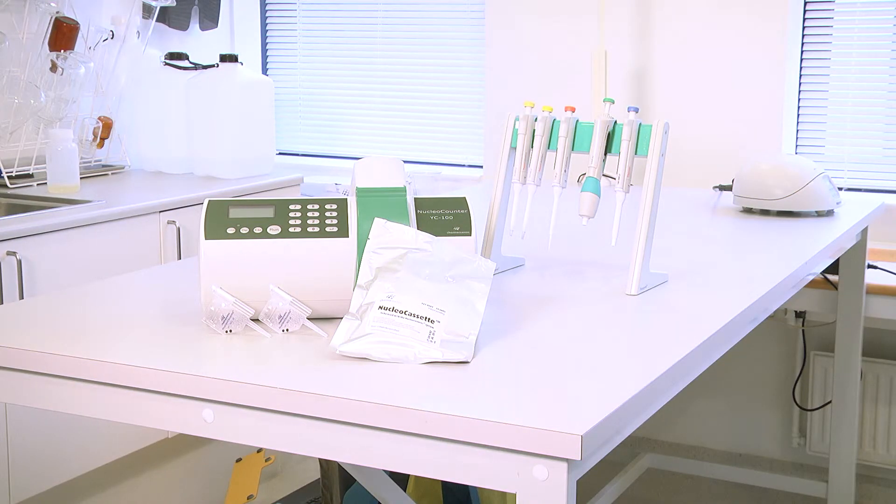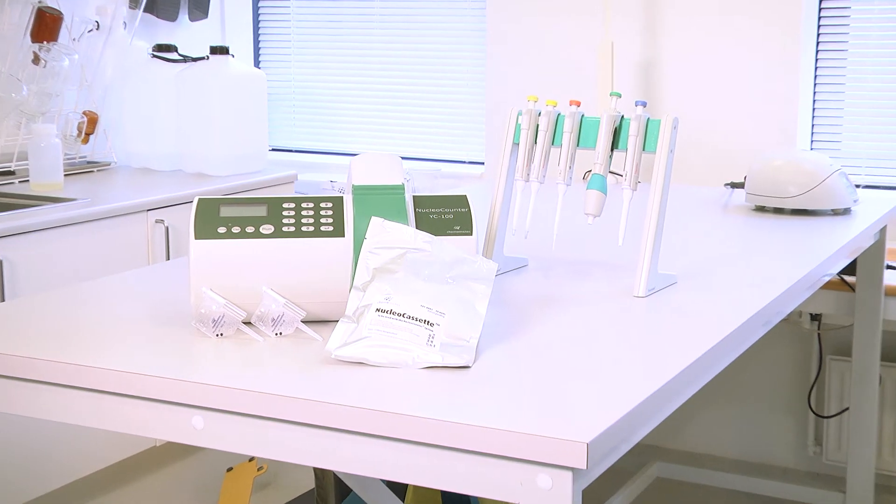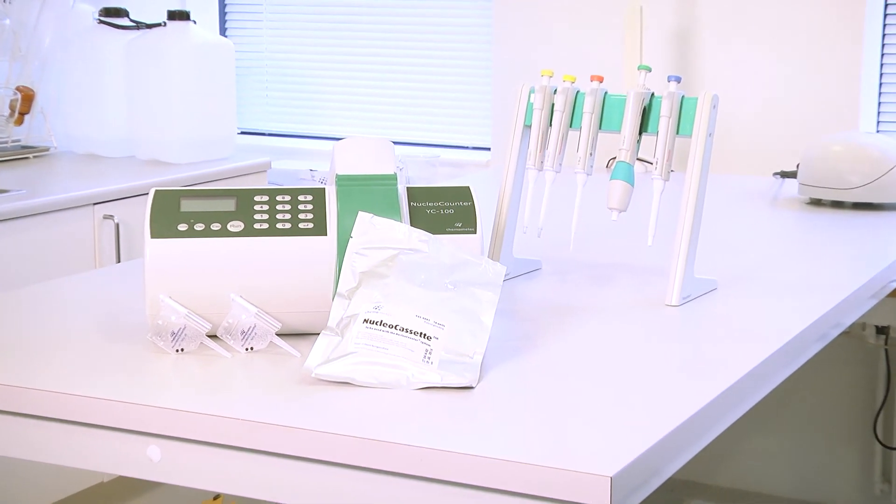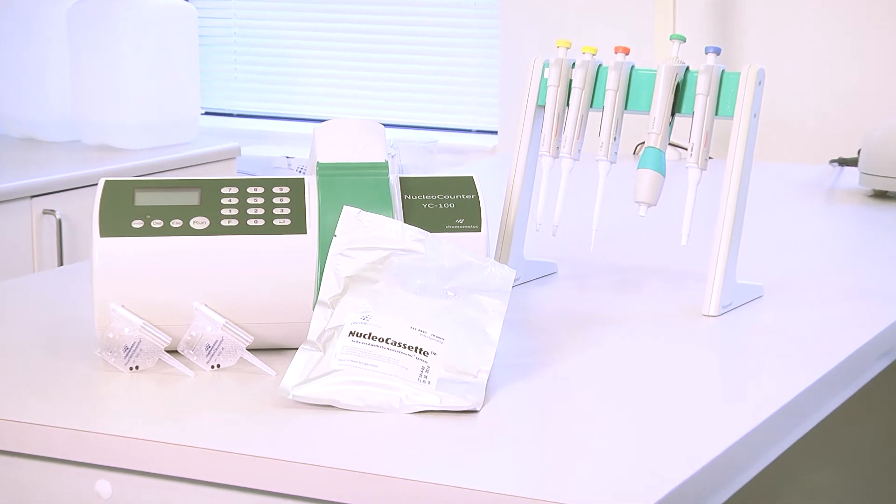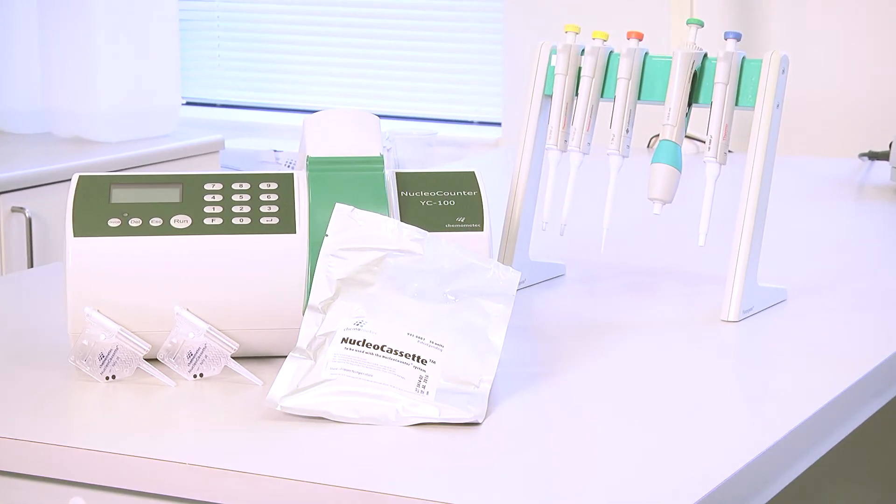The YC100 is the new gold standard for yeast counting. It offers precise, reliable and objective results, no service, no calibration, and easy to use.